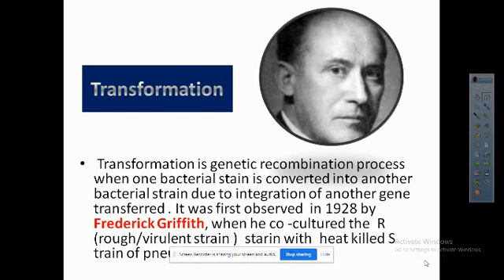So for the cloning process, we must ensure whether the DNA has been integrated or not. Once the DNA gets integrated, the bacteria which harbor this integrated DNA with the vectors are said to be transformants, and the process is transformation.